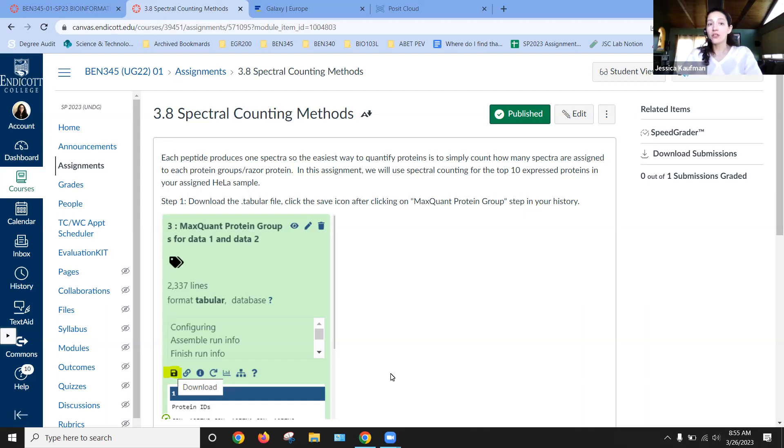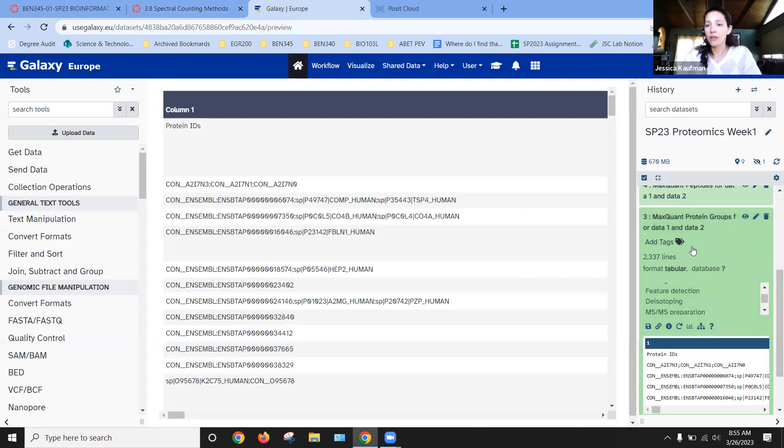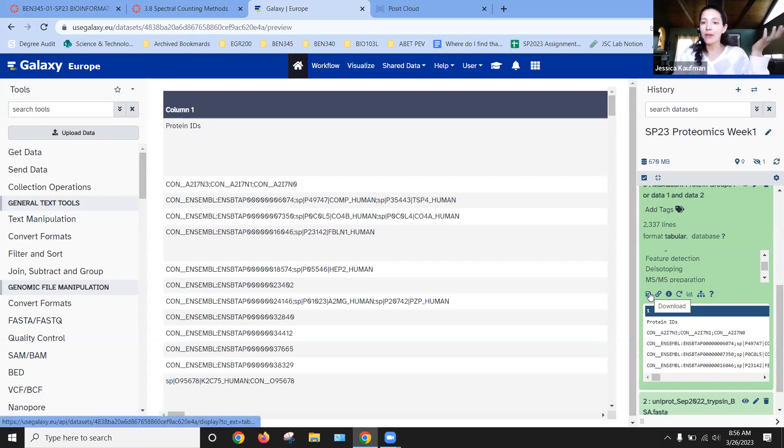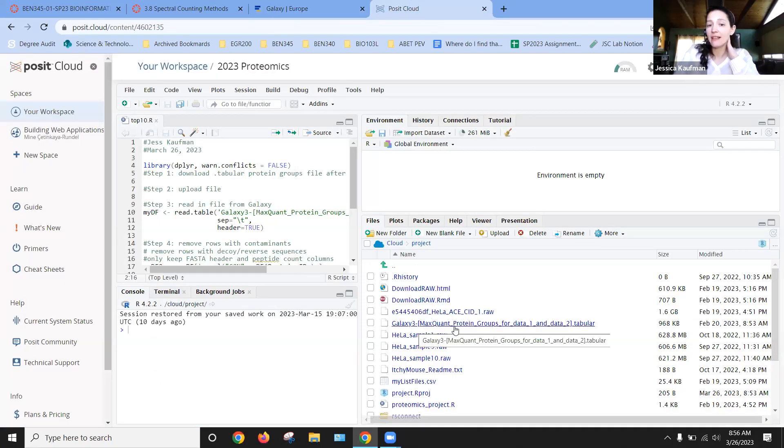So we're going to start by going to our history and downloading the MaxQuant groups. You can click the save icon to download, and then uploading that data to Posit Cloud. So I've already uploaded this, you can see Galaxy 3 MaxQuant protein groups for data one and two.